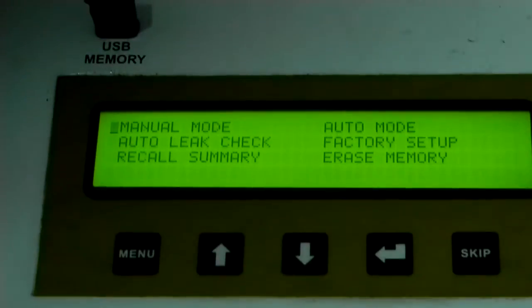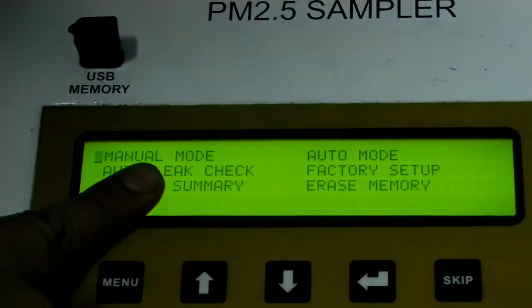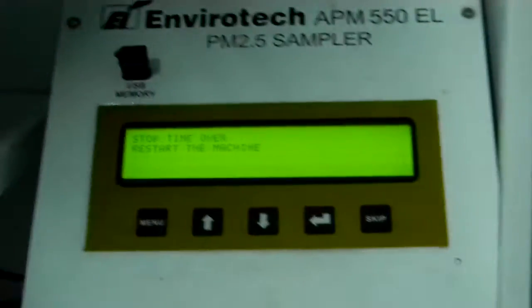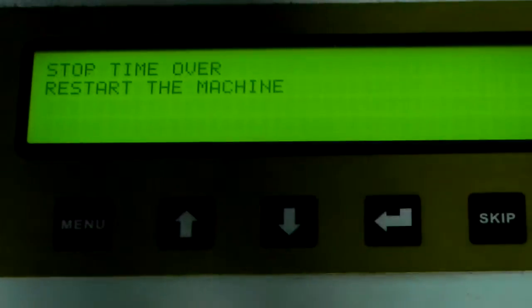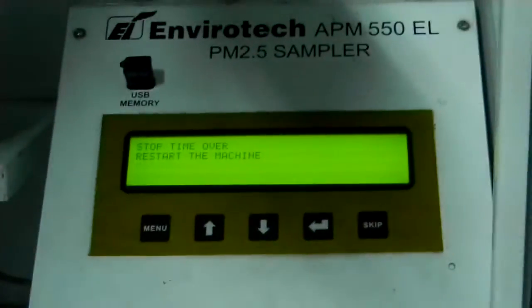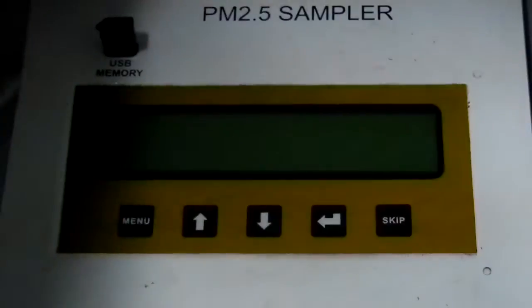In the control unit there is a full menu. There is a manual mode where you simply start and stop it. Then there is an auto mode where you can schedule the start time and end time. There is also a leak check and other options. After some time the machine will show that the time is over, so you switch off then switch on again.